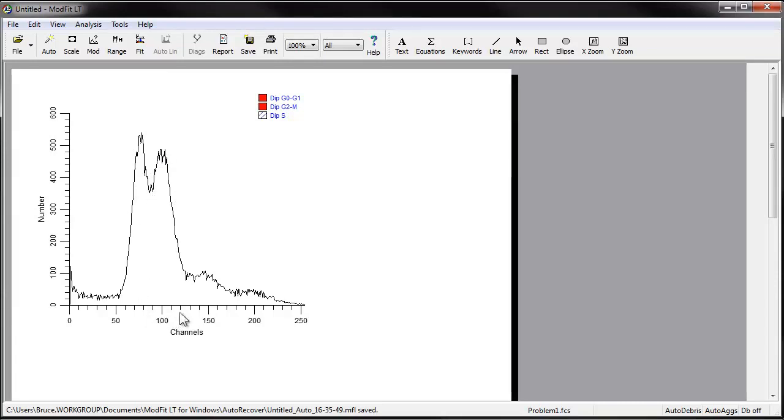In this example, we've missed both of them. This is a circumstance where you must use manual analysis to model the sample.